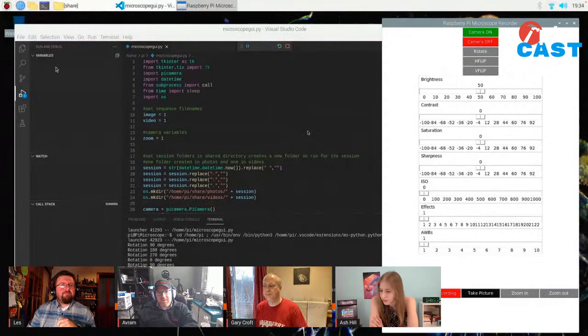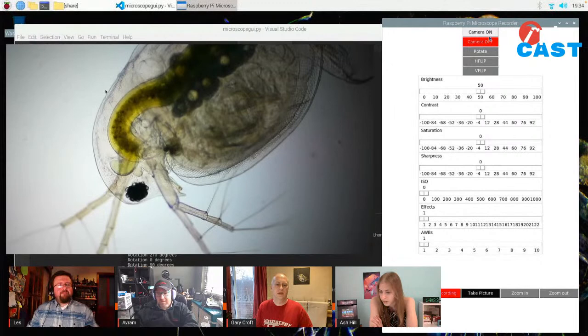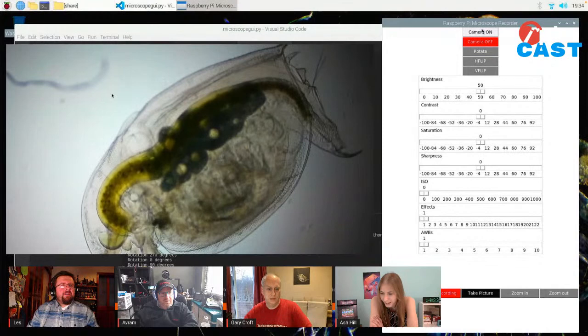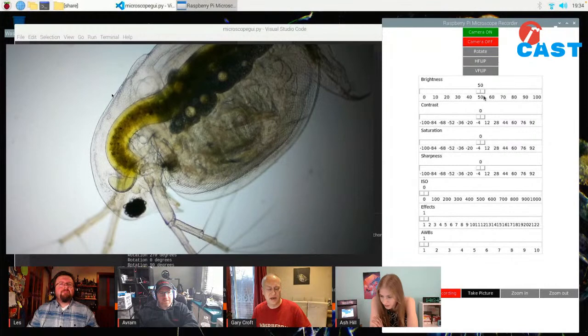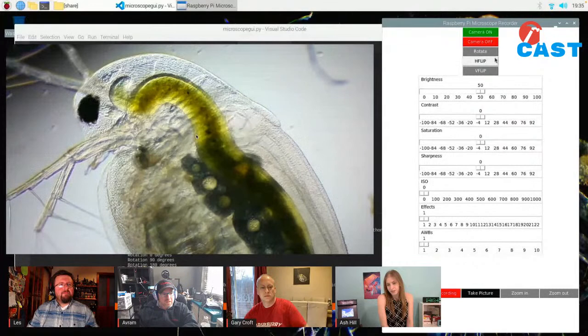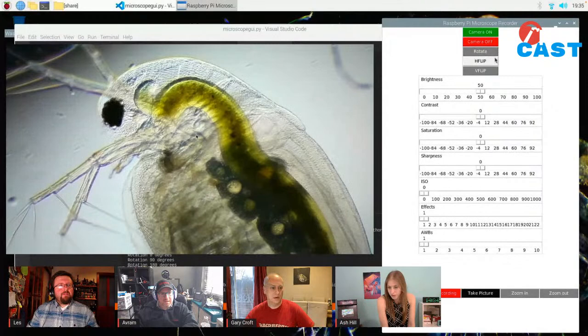I've written my own software for it. That's the raw output from the Pi HQ camera. What creature is that? That's a water flea - Daphnia. Now, the default settings of the Pi camera - when I first started, it was just large buttons: camera on, camera off, start recording, stop recording, take picture. I basically used the entire Pi camera module and built it out so now I can play with all the settings. The first thing I can do is rotate it. What level of magnification is that? It's only 40 power because it's quite a large creature. You can see there are some microscopic things in the background.